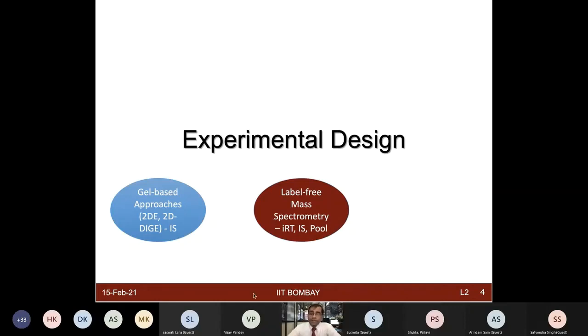And in this case, when you're looking at label-free quantification, you also think about what is going to be your internal standard, which you might want to spike in along with your sample of interest. Or sometimes people also use the retention time peptides, which are iRT peptides, so that you can monitor the chromatography, how reproducible it is at a specific time when the peptides are eluted from the LC-MS column.